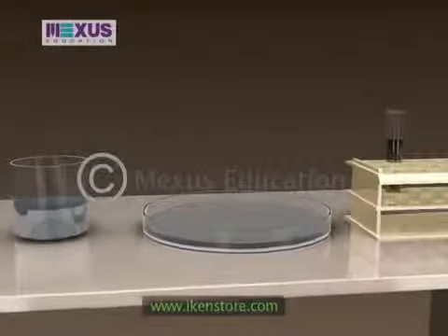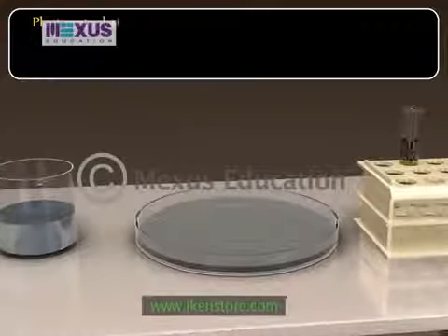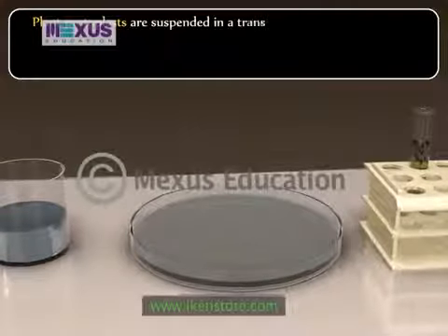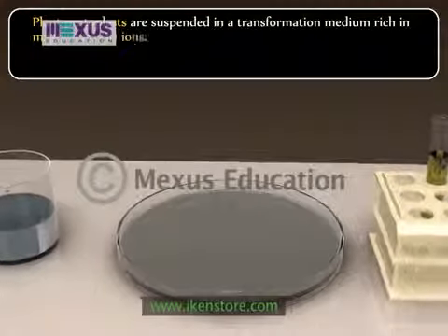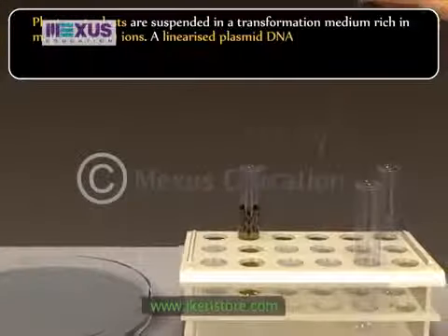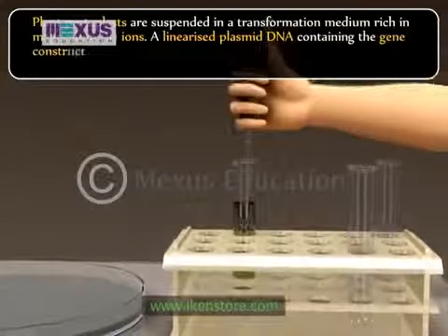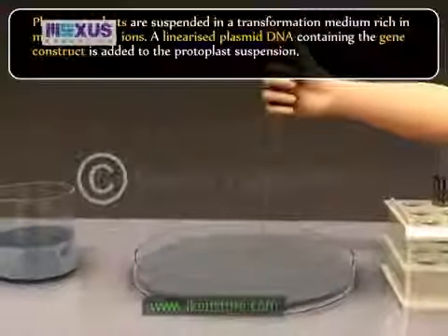The first method is a chemical method. Plant protoplasts are suspended in a transformation medium rich in magnesium 2 ions. A linearized plasmid DNA containing the gene construct is added to the protoplast suspension.